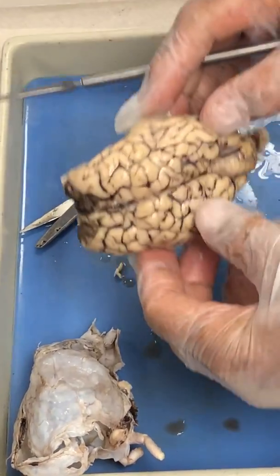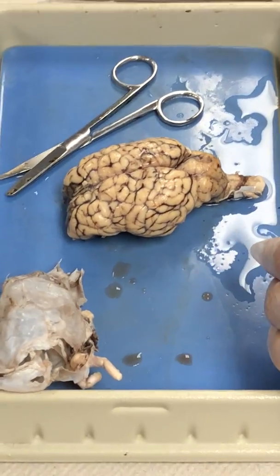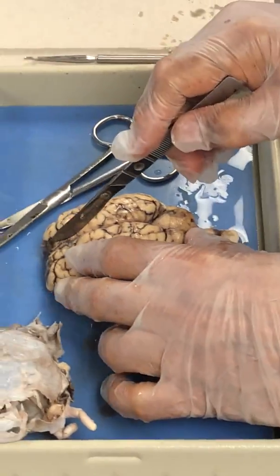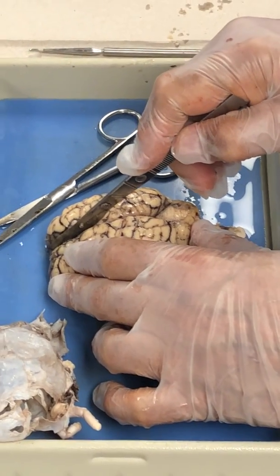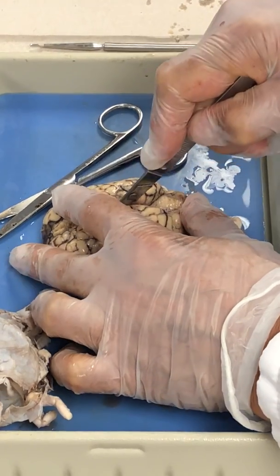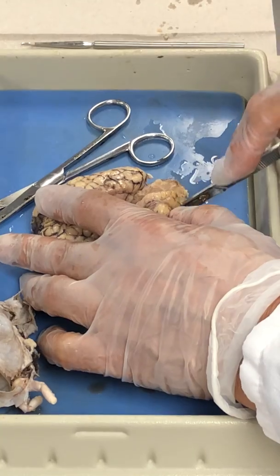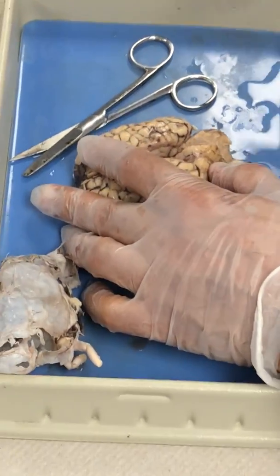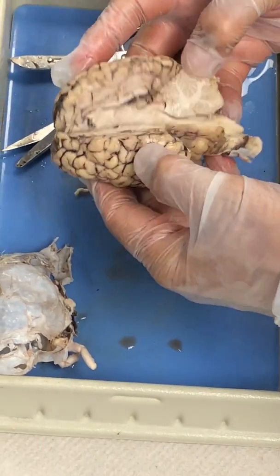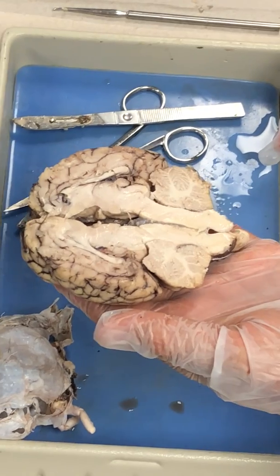After you're done with that, what I usually do is I put the sheep brain down and get a scalpel, and right through the middle, where that longitudinal fissure is, cut all the way through. And then have the sheep brain open just like you're opening a book. You have two sections.